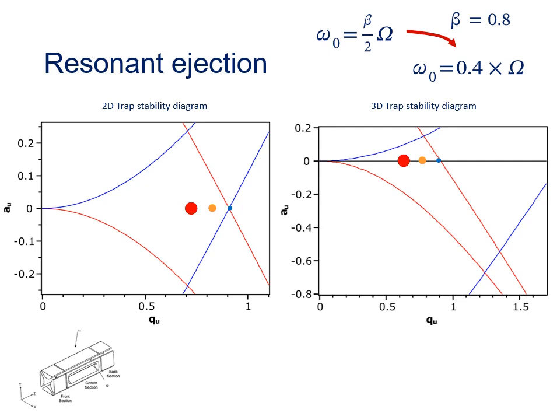In our imaginary linear ion trap, both the X and the Y rods will already have the 800 kHz quadrupole drive frequency being sent to them. But now, if we add an extra signal only onto the X rods, and where this extra signal has a frequency of 320 kHz, when ions reach a beta value of 0.8, they'll be resonantly excited by this signal and ejected only in the X direction.